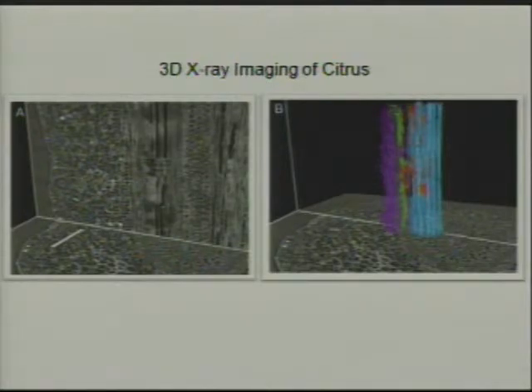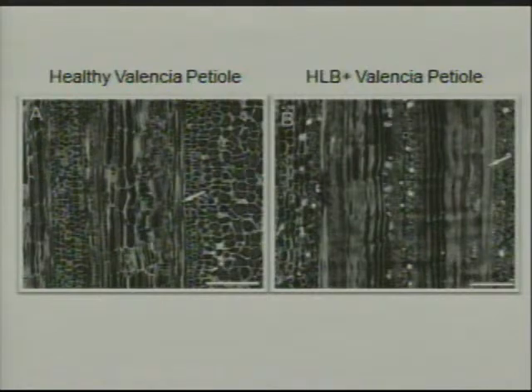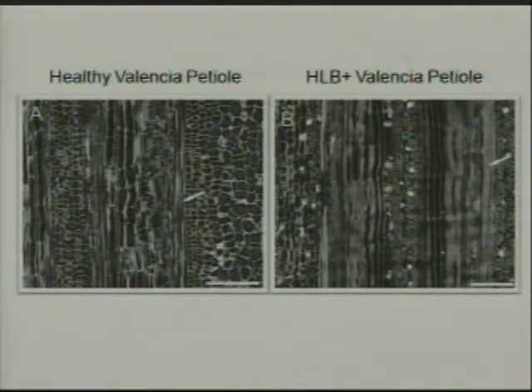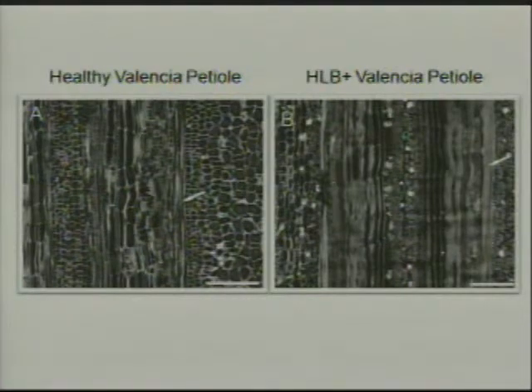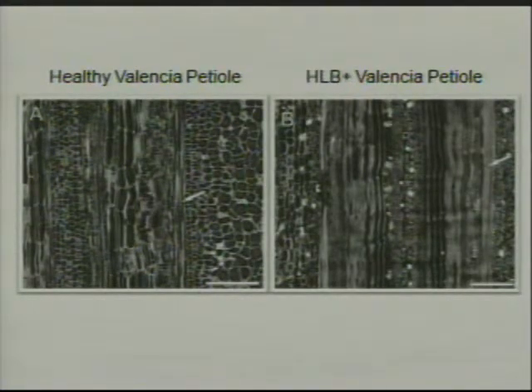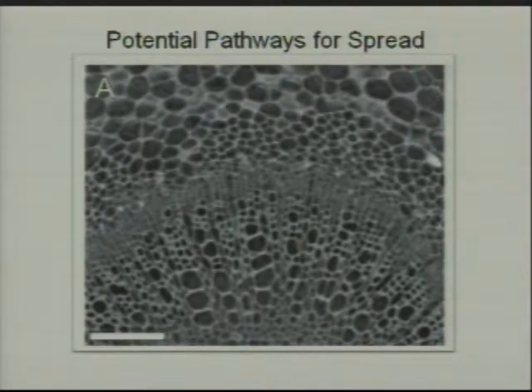Hopefully we can figure out how the bacteria are moving around. We know they're in the green area — the phloem. What sorts of pathways are there around the stem? Looking at longitudinal sections through a healthy or HLB-positive petiole, we notice the same things as with traditional light microscopy. In the healthy tissue the phloem looks okay — we can actually see some sieve plates. In the HLB-positive tree, the phloem is completely collapsed again. We also see a prevalence of calcium oxalate crystals — these bright white spots — packed throughout, plus large accumulation of stored starch in the petiole.